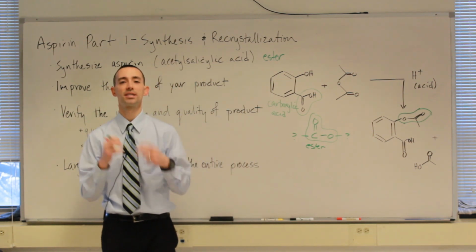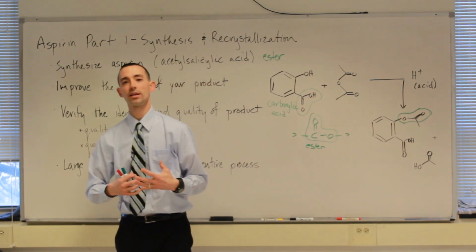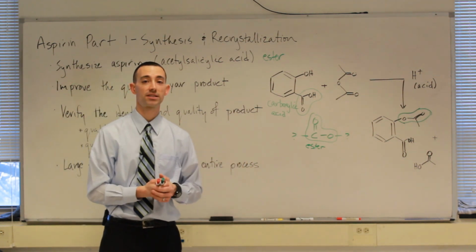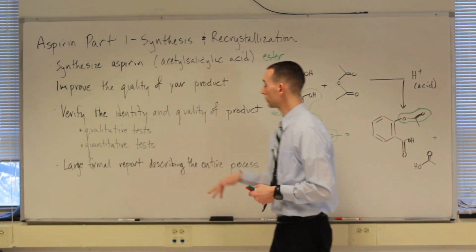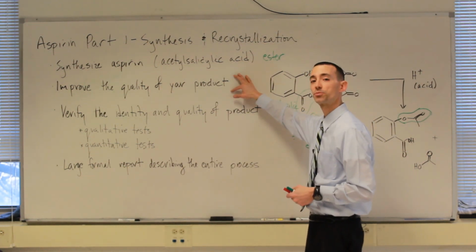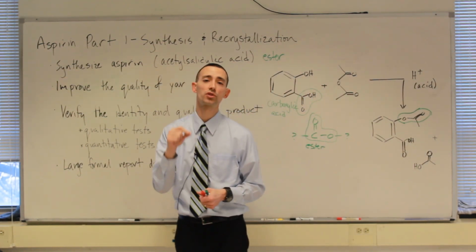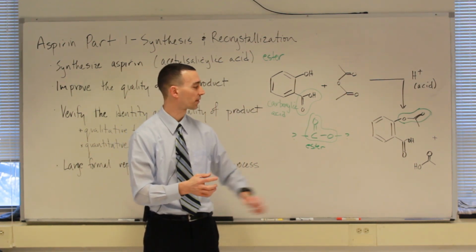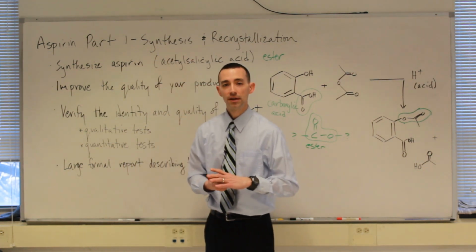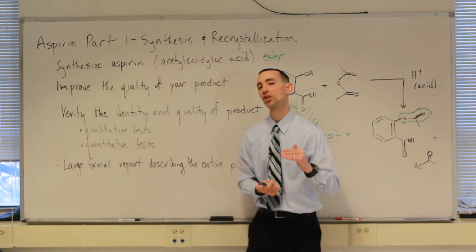So this leaves some contaminant in with our product that we're interested in, which becomes really the focus of the second stage of our work and then what we do in the next 2 weeks of lab. So after you make and crystallize your aspirin today, then we want to improve the quality of that aspirin by recrystallizing it. So in this case, we'll dissolve the solid that we collect from the first reaction into a small amount of ethanol, heat it up, and then we will add water again and allow it to very slowly this time form crystals.